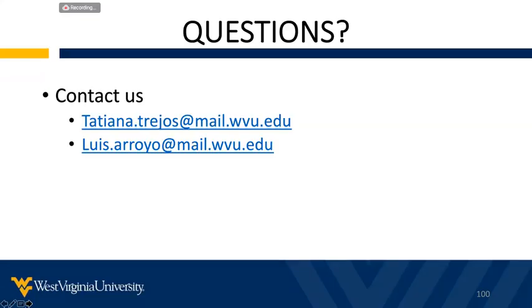One is the shooters directly from activity, directly after shooting, and we consider that anything from immediately after versus 3 hours. We haven't done the study of how different it is under controlled conditions at time 0, an hour, 2 hours, or 3 hours. In general, that whole population that we have presented so far is anything from time 0 to 3 hours, a combination of those.